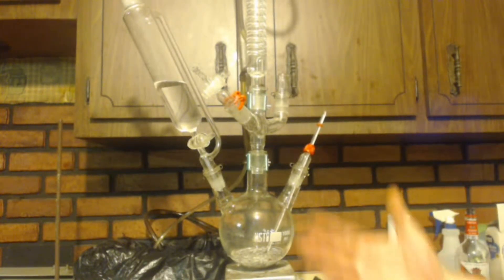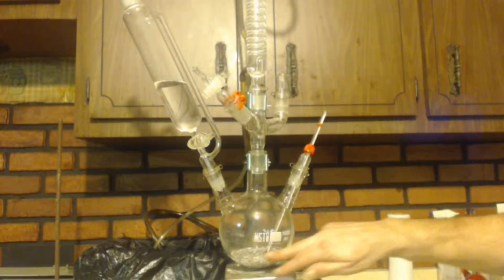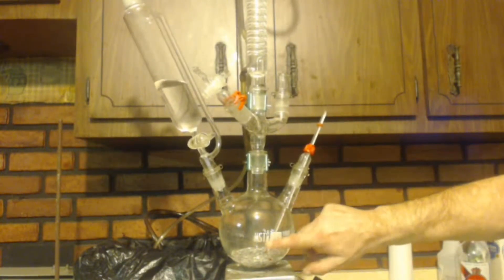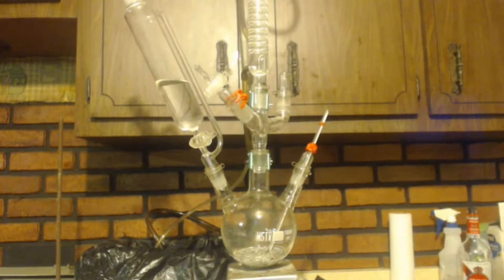If you want a step-by-step guide, go back to my first Grignard reaction video. The differences I'm doing here: I put diethyl ether into the pot with the metal this time — the first Grignard I didn't, and that was a bad mistake. I also have a Graham condenser instead of a regular condenser, plus another condenser and a drying tube.